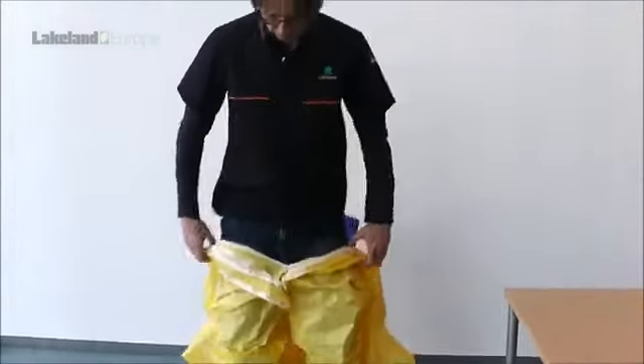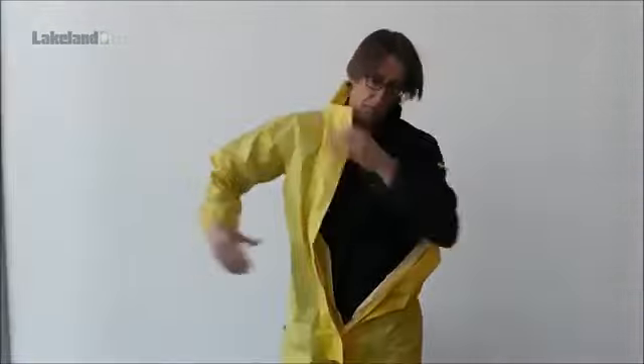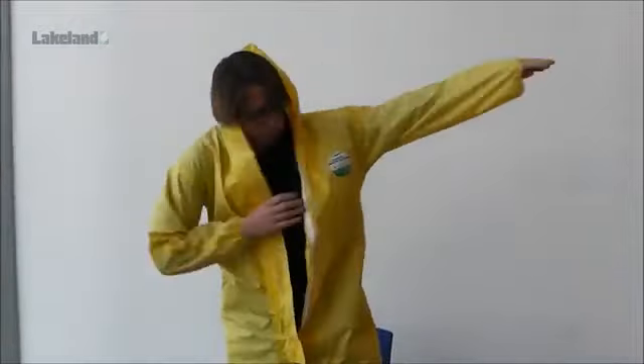Returning to our main donning process, you should now stand and push your arms into the sleeves one at a time. Take care not to put any strain on the garment at this stage. If you find it difficult, it may indicate you need a larger size.